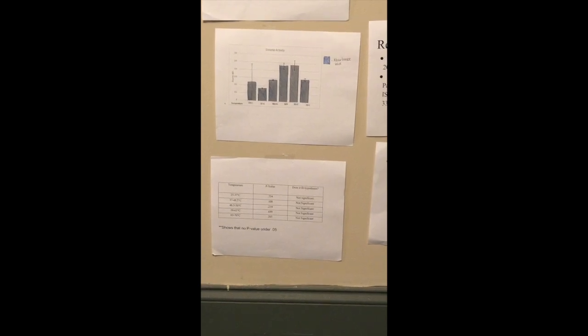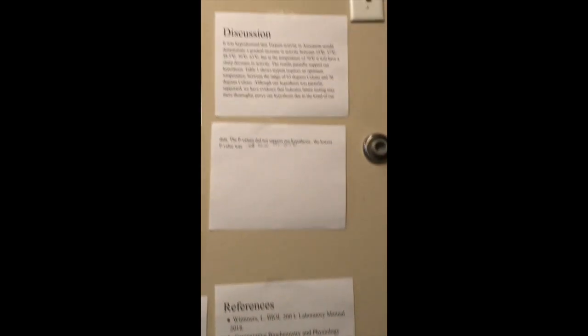Enzyme activity did increase drastically from 0.277 at 48.5 degrees Celsius to 0.46 at 50 degrees Celsius. It also showed a drop from 63 degrees Celsius, where it was 0.473, to 70 degrees Celsius, 0.295. Our standard deviations, excluding 23 degrees Celsius, were all under 0.06, ranging from 0.004 to 0.05.